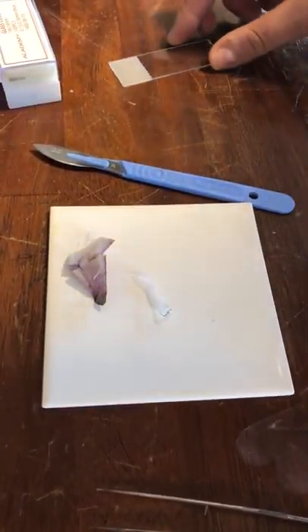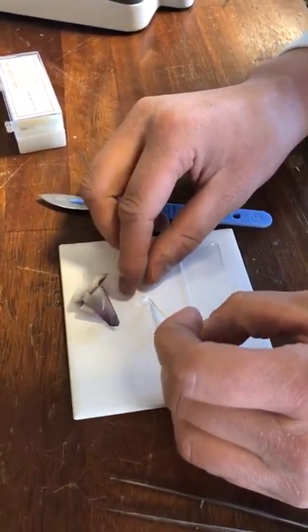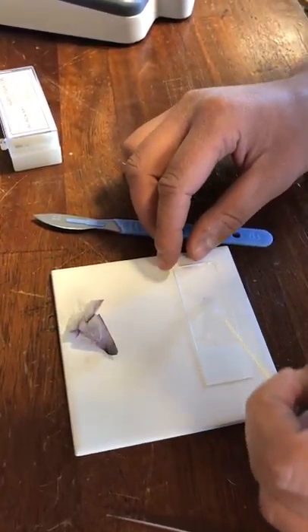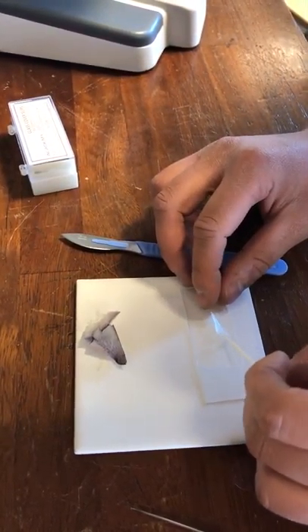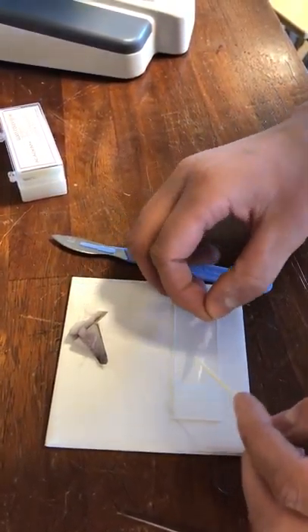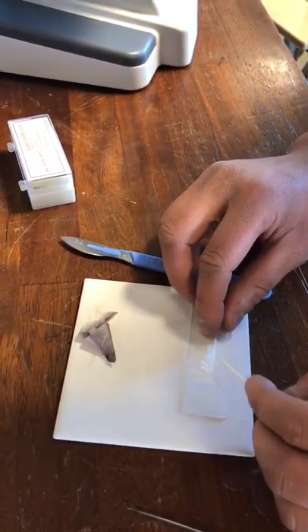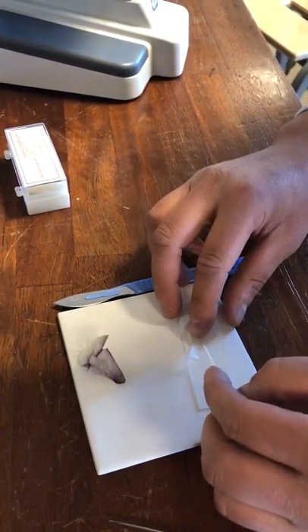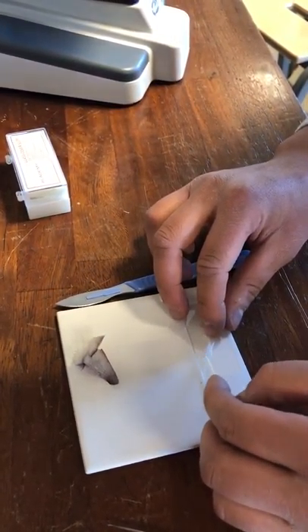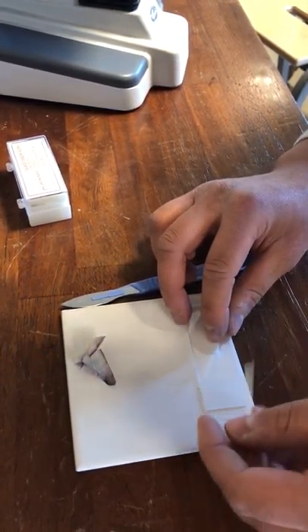The next step — get your slide and pop it on. Now the reason we're using a toothpick is because we don't want any air bubbles. Quite often these can be mistaken for parts of cells underneath a microscope, so I'm just going to try and get that flattened out as best we can.